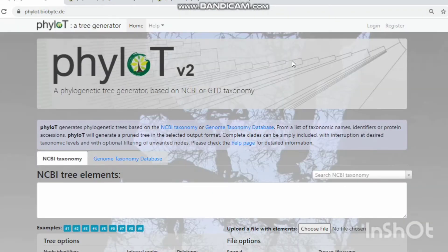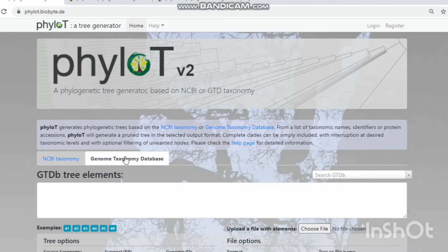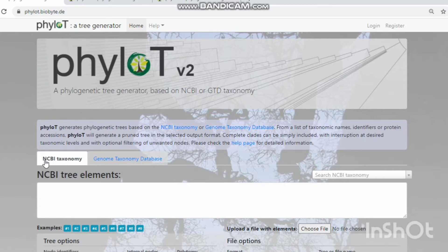This is the home page of PILOT. PILOT has the interrupted option to start the phylogenetic tree generator based on the family or order, and to add a tree element based on the NCBI taxonomic database or the genome taxonomic database. I want to add the tree element based on the NCBI taxonomic database.